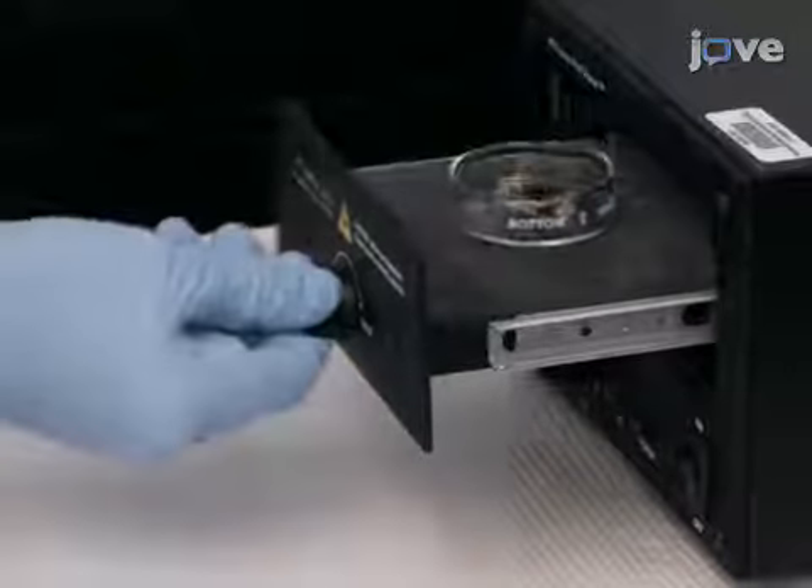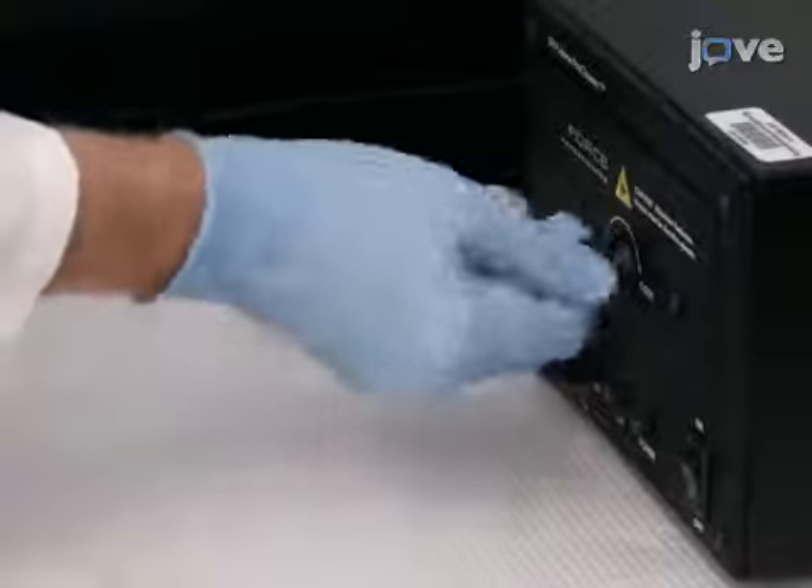Place the gold chip in a UV ozone chamber for 30 minutes to remove any contaminants.